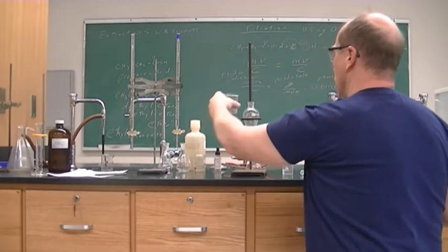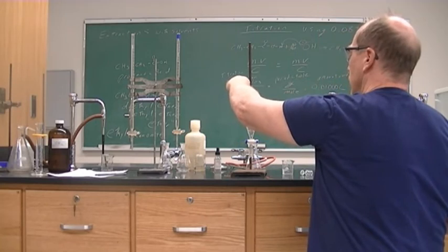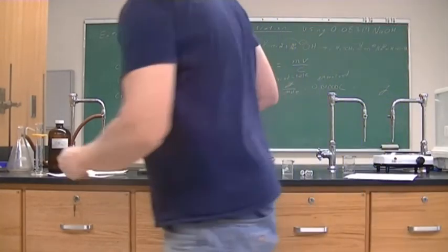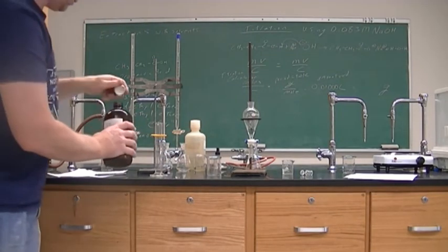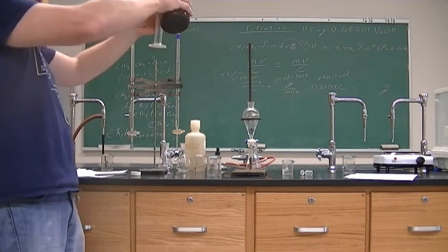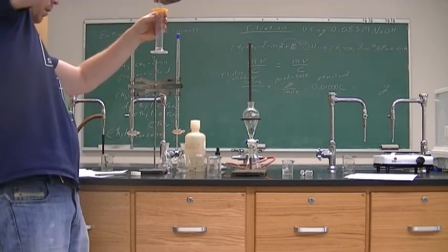So I put the water back in, and then my third 5 ml sample of ether, and so I'm going to use the same amount as I did with the simple one. I used 15. This time I'm using 5 three times.